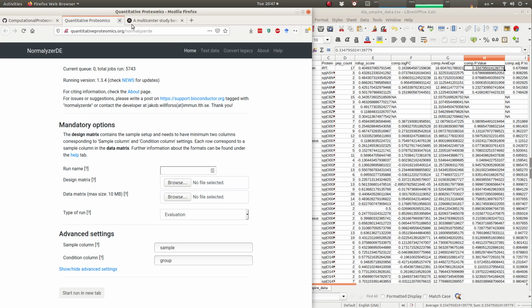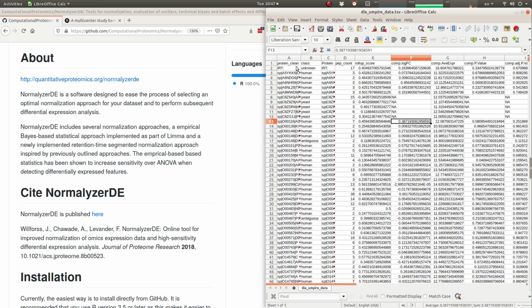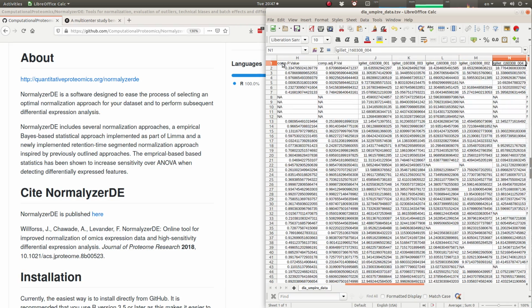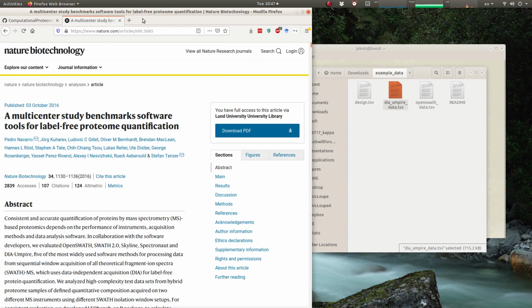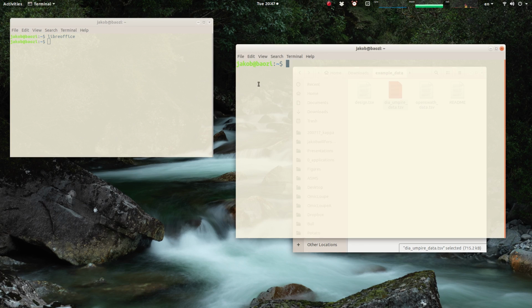So that's one way to do it. So then we know we have the annotation columns, which are the first ones up to the PEP count roll-up score. Then we have the 4 statistical columns, and then we have the data columns. So with that, we're ready to run OmicLoupe.